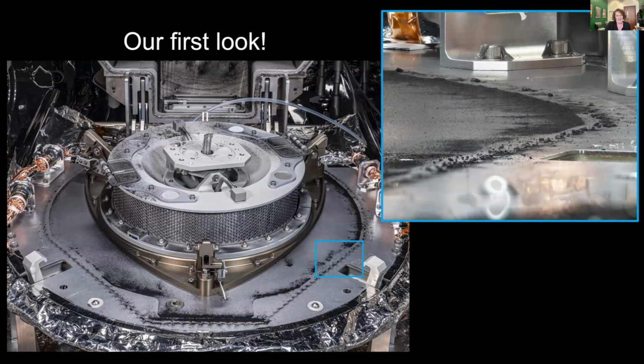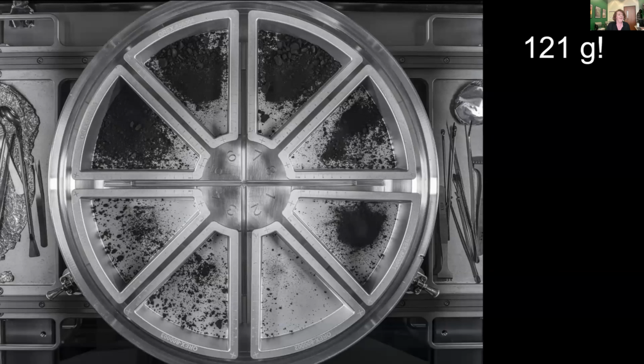Actually, this was great. We anticipated this might happen, and that enabled us to get access to sample a lot quicker than the several weeks it took to get into the TAGSAM and disassemble all the bolts and unscrew everything and take off the witness plates and do all of that really intense disassembly. Instead, Curation was able to scoop up a little of this material and hand it out to the science team so that we could get started on our analyses right away.